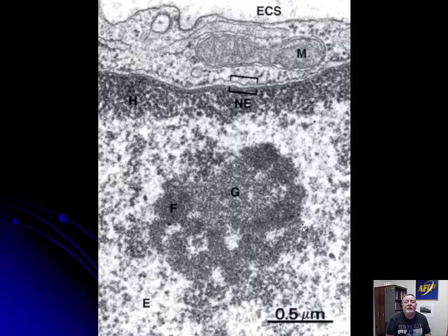Now, when you have degeneration of the nucleus, generally the first to go are the nucleoli. They just sort of disappear. I don't think that you can say there's no nucleoli, this cell is degenerate. You can say that there's no nucleoli, and if you have other features of cellular degeneration that go along with it, maybe you can make an interpretation. But I simply note the presence or the absence, and that's about it. So they're cool, but they're not very useful in terms of ultrastructural description.